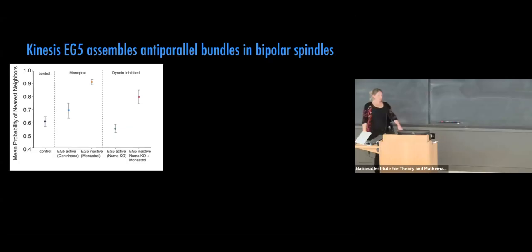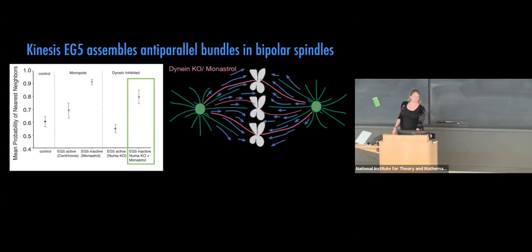So I think I have a cartoon. One question: the arrangements of microtubules, is there any kind of crystalline ordering in the angular direction, or is it more like randomized? We didn't look at the angle, but maybe that's a thing we should look at. We had not looked, yeah. I mean, we can do this in the tomography data, I think. We kind of, but yeah.